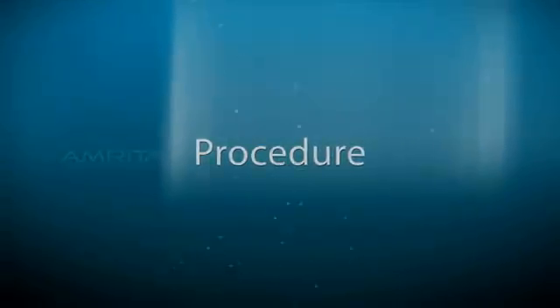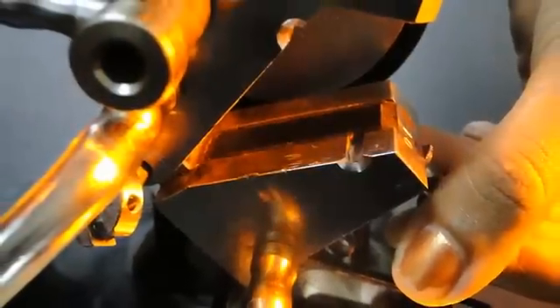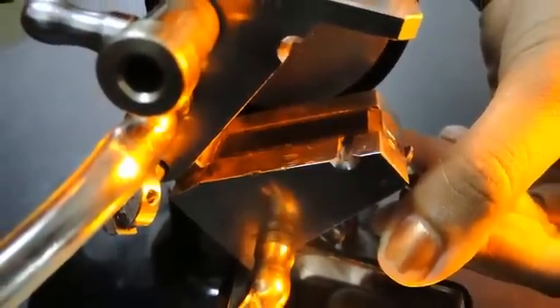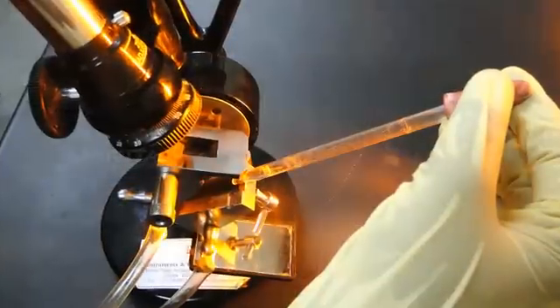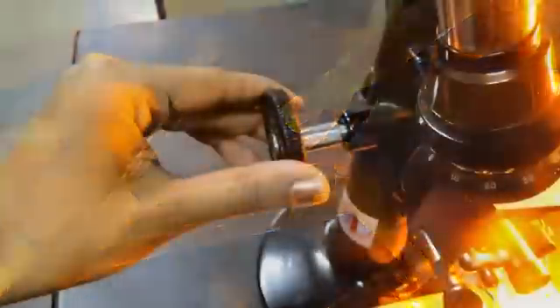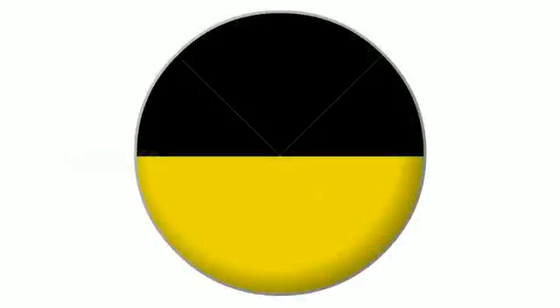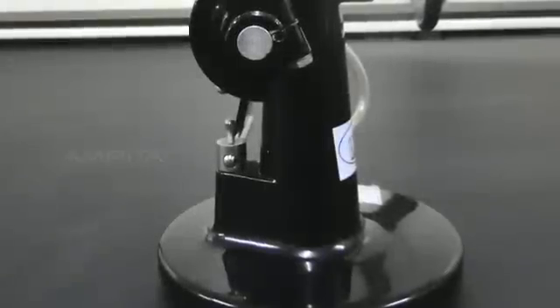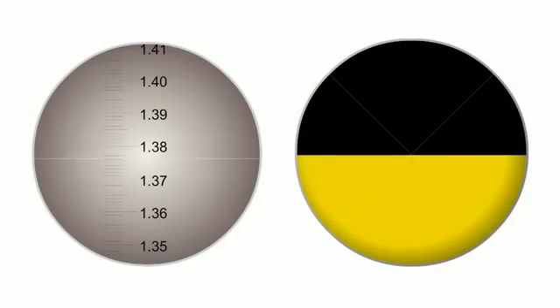Procedure: Turn on the light source. Open the double prism of the refractometer. Clean both glass surfaces and close the double prism. Use a pipette to fill the space between the two prisms with the given liquid. Turn the refractometer scale knob to get a clear interface between the illuminated and dark regions. Use a micrometric screw for additional refinement of the scale until the clear interface appears.